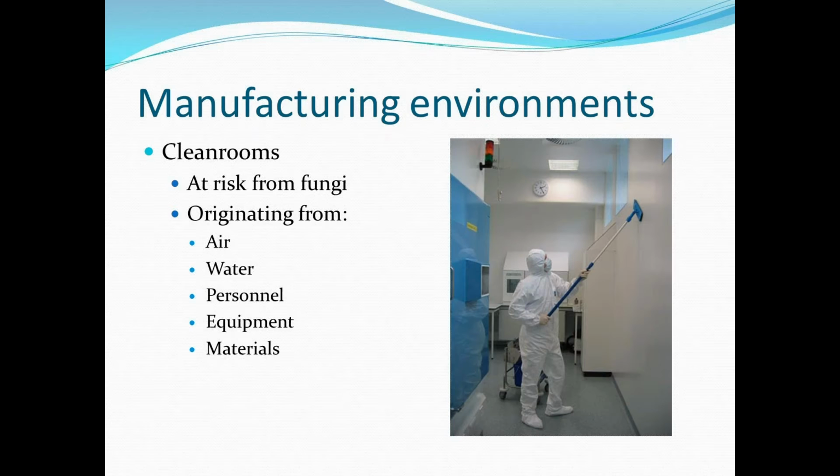But perhaps the biggest risk is from air, because fungal spores, which can range in size from 1 to 50 microns, can be easily dispersed into the clean room environment. Depending upon the air distribution, and given the fact that many clean rooms have turbulent airflow, they can be distributed to many parts of the clean room. So we'll have a look at aspects of manufacturing in a clean room in more detail now.